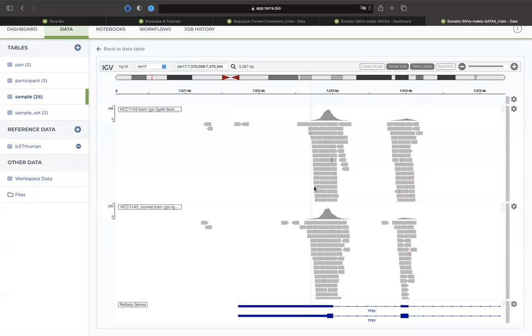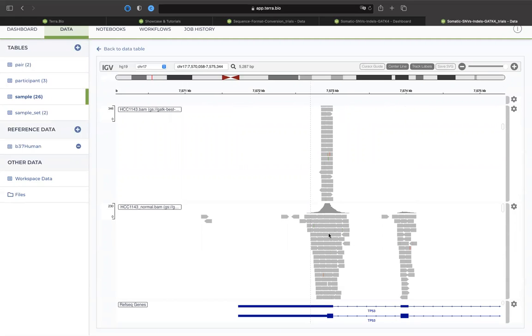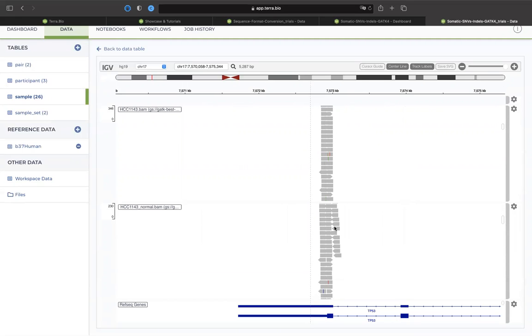All right, so you can see it's only on, let's see, one read. It's not represented in all the reads. So I mean, this is more likely to be spurious. Normally, it gets variance at the edges of the reads, and is less represented. You have little confidence in this.